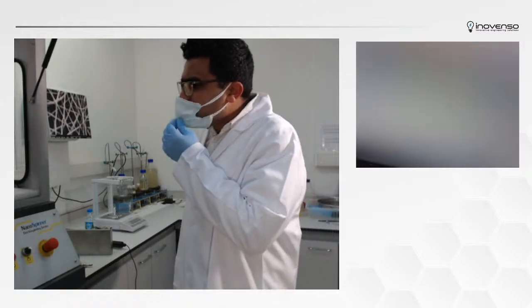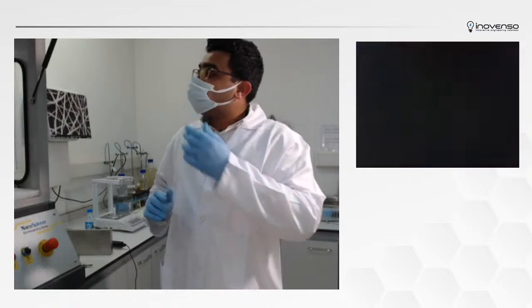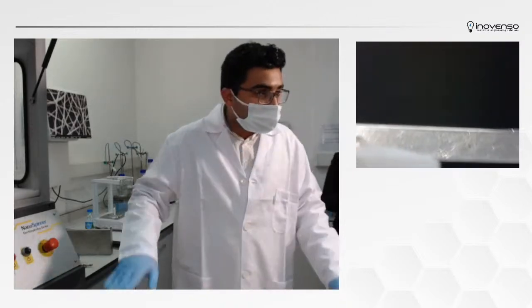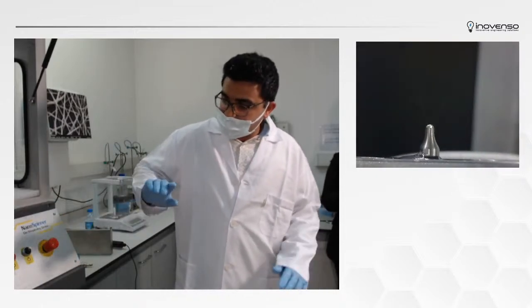I should mention that since we're dealing with high voltages, there are some safety features of the machine. In case you need to turn off the voltage supply, or turn off the machine entirely, you need to press the emergency stop button, and this should cut the voltage supply of the machine.